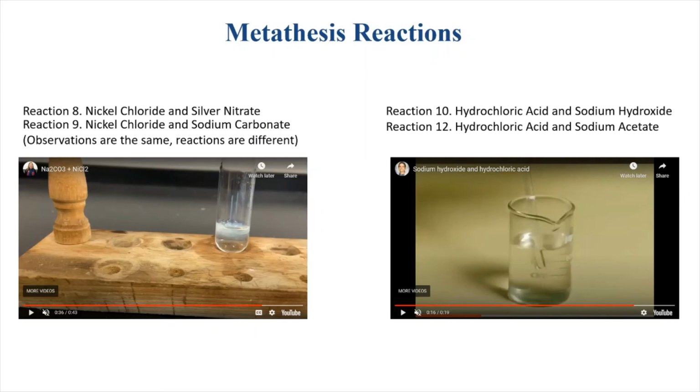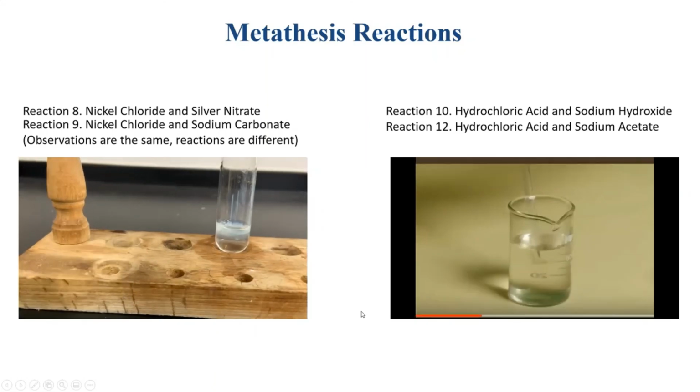When you combine hydrochloric acid and sodium acetate, it looks exactly like what just happened. The only difference is with the sodium acetate, you get a little bit of a vinegar odor. Now remember, vinegar is acetic acid. So that may also help you to determine what happens with the sodium acetate and hydrochloric acid.